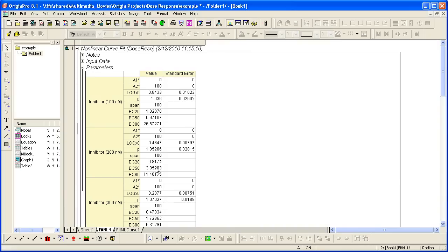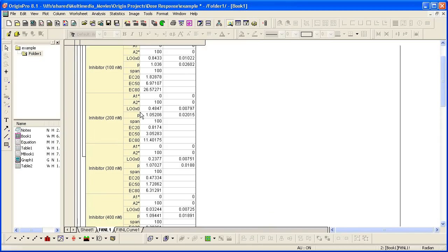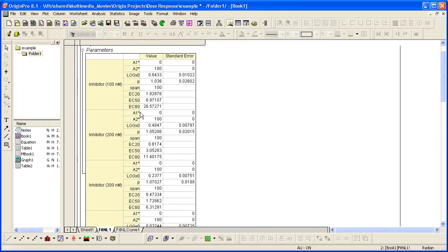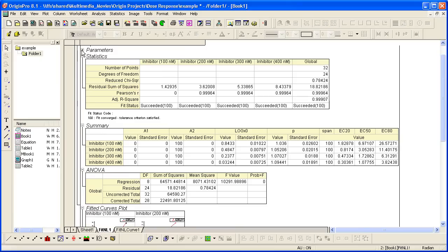Since there are eight parameters, including the derived parameters, it's easier if I scroll down here. We can actually collapse this table and look at the summary table. This table organizes all the parameter values horizontally. So it can be used to compare critical results such as EC50 and EC80.